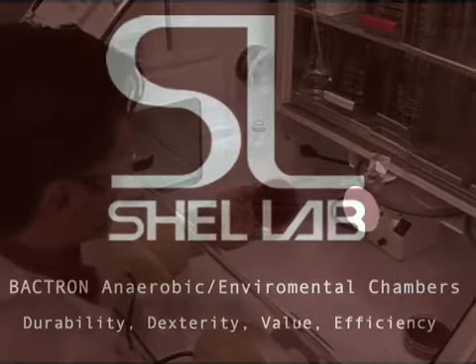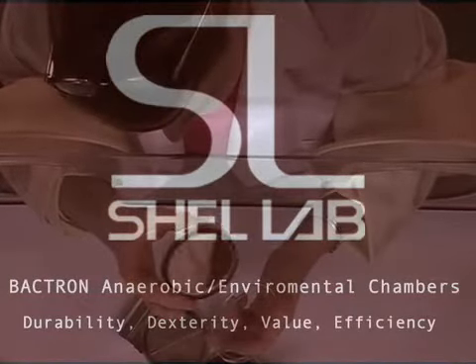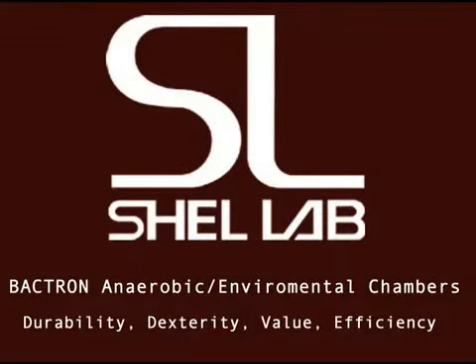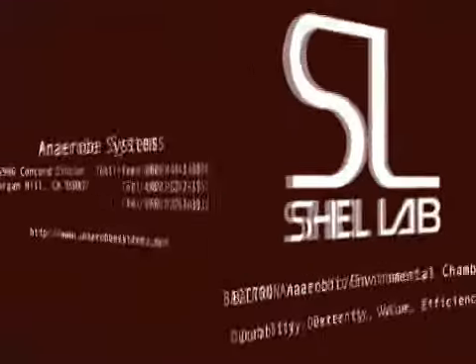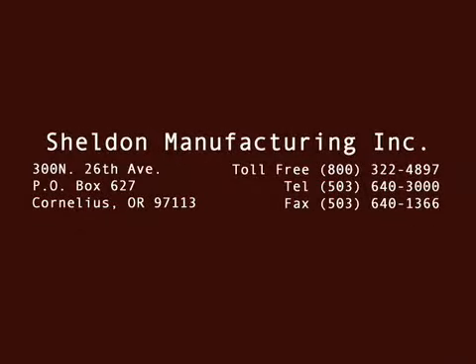Contact Sheldon Manufacturing today for a quote on a Bactron chamber that is right for you. This concludes our presentation of the Shell Lab Bactron Anaerobic Chamber, brought to you by Sheldon Manufacturing Incorporated and Anaerob Systems Incorporated, partnering to improve anaerobic microbiology for over 15 years. Thank you for joining us.